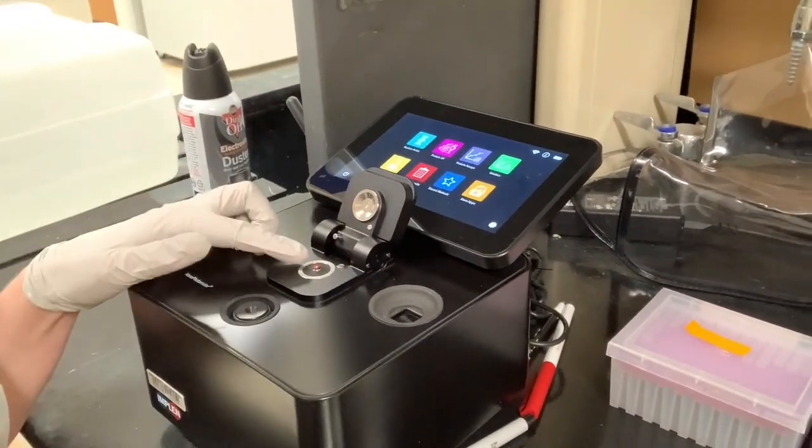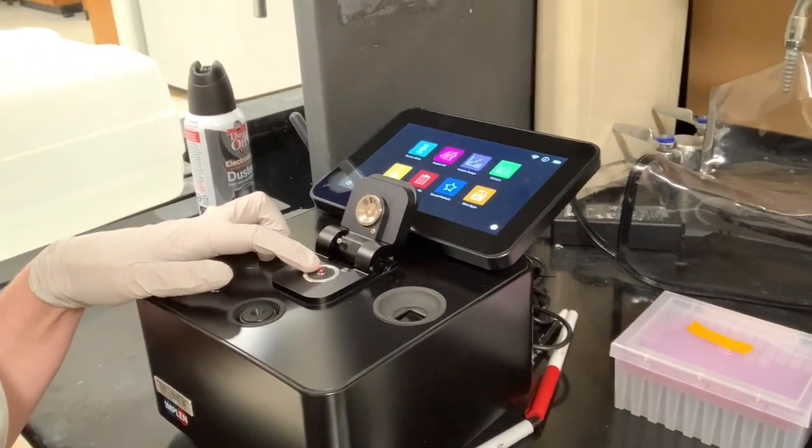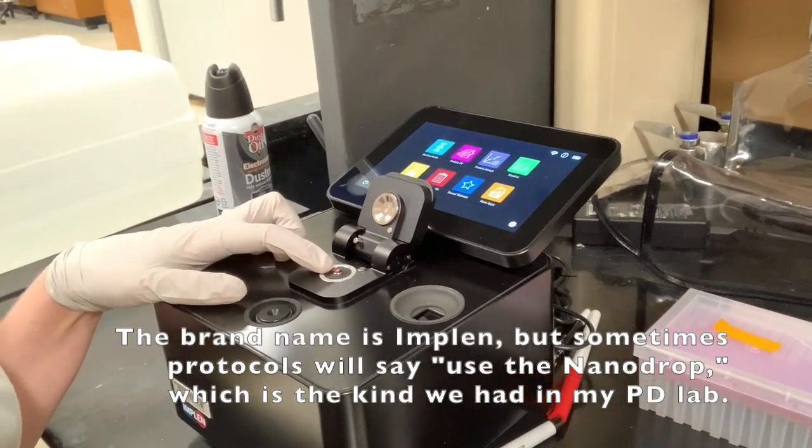And it has a little, I guess you would call it like a pedestal, where you can put your sample. And then a light will shine through your sample and evaluate the concentration of nucleic acids in there based on absorbance. And so I'm going to try to do this by myself. Usually I do this with two hands, but I'm going to actually try to flip you around to show you how to do this, and hopefully it will help.